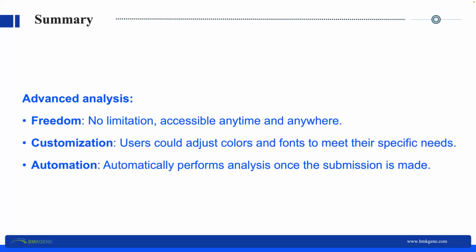If the analysis and all the task or the process is finished, you can check it in BMKCloud. You don't have to change the parameters or upload the matrix or table the analysis need. BMKCloud will do all this part automatically.